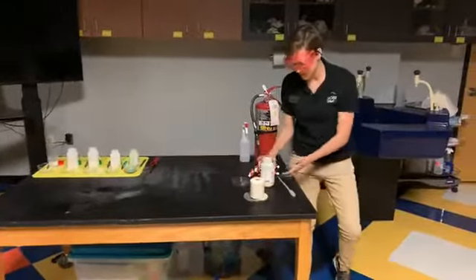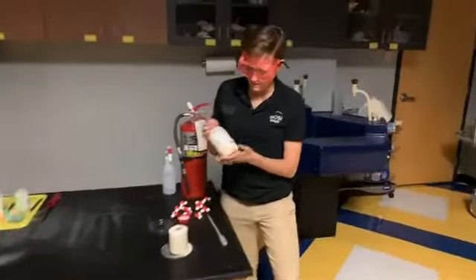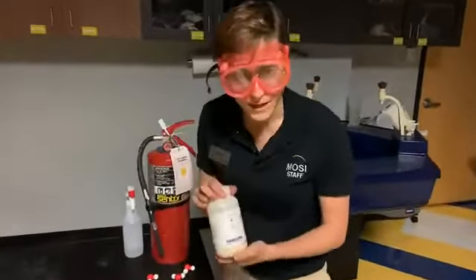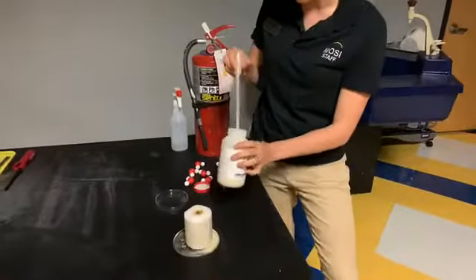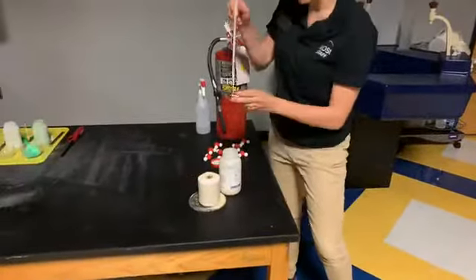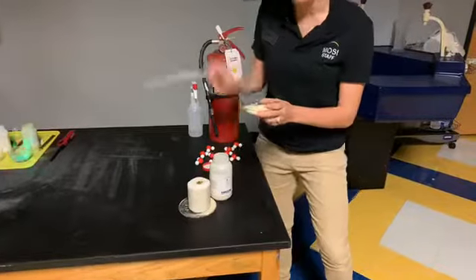All right. Now I have another thing that I want to show you guys here. One more combustion test. So this is some lycopodium powder. Lycopodium powder is just a powder that we make with a special type of moss. And it's very, very, very fine.